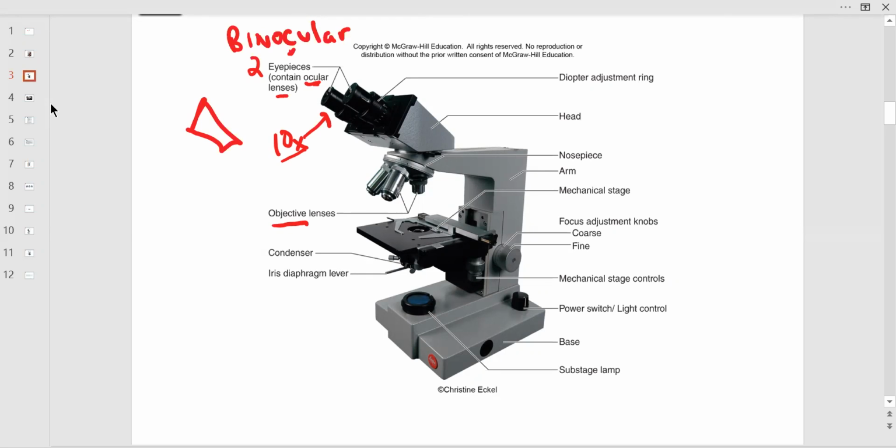Okay, so looks like there's 3 or 4 different magnifications on the objective lenses. And this thing rotates. You're going to see that, of course, in the thing. They have a nose piece, right? I probably won't ask you that, but you have to know the objective lenses. And here's another place, like this whole thing rotates and it clicks into place. Really important too, that it clicks into place, because you'll be in between magnification. It's like riding a bicycle where you're in between gears, you know, if you don't lock it in nicely, right? Everybody ride a bicycle here, hopefully, sometime in their life.